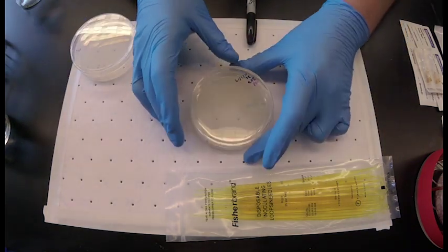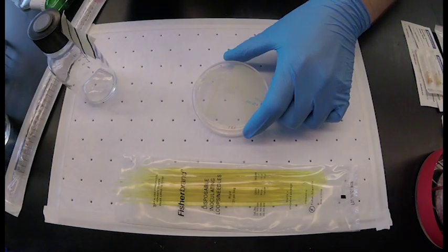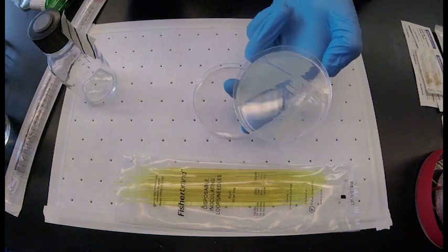Methanotrophs can be grown in large quantities in liquid culture started from a solid plate. You'll need sterilized glassware.